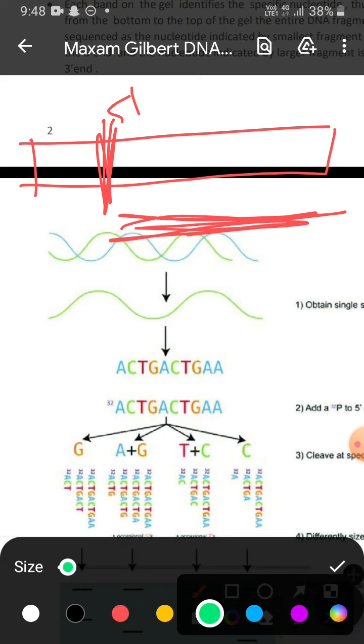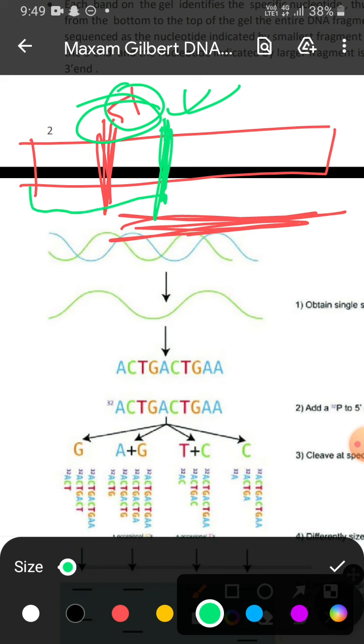Okay, now as you have used a mixture of restriction endonucleases, suppose there is another cut site present of another restriction endonuclease. Can you use this restriction endonuclease to fill up what is present in the 5' end of your DNA of interest that you are willing to sequence, just like a jigsaw puzzle method? Yes, obviously, because here your 5' end can be sequenced by this part.